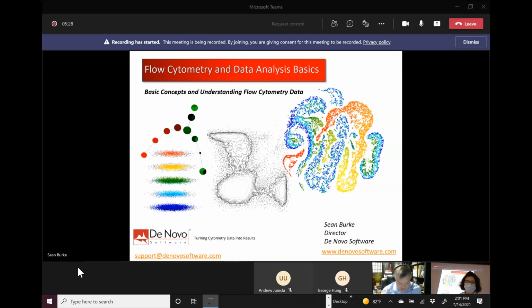Yeah, absolutely. Thanks, Denise. My name is Sean Burke. I'm a director of research product development here at De Novo Software. We make a software program for analyzing flow cytometry data sets. I understand that there may be a little bit of flow cytometry going on tomorrow from some of the cells that are being grown up. Essentially what I've been tasked with today is to give you a little bit of a primer about flow cytometry in general. It's a broad field, and I'm going to be going through a little bit of that, some data analysis techniques, and of course a little bit about how to use our software for analyzing some of the data.